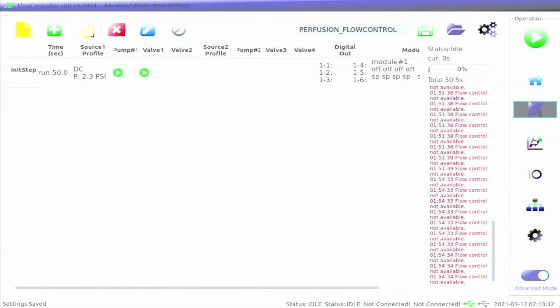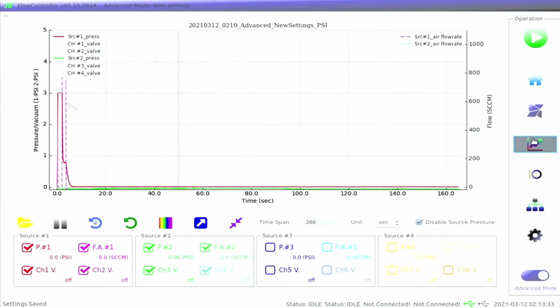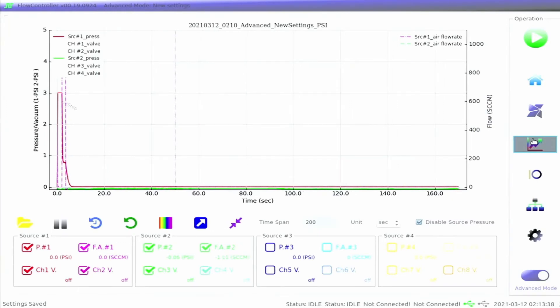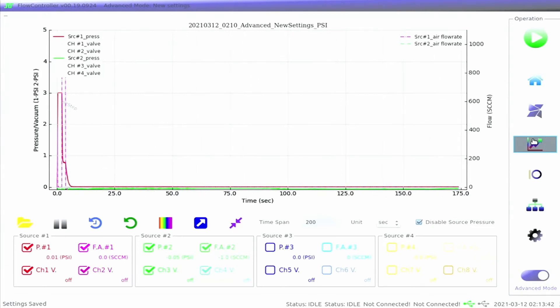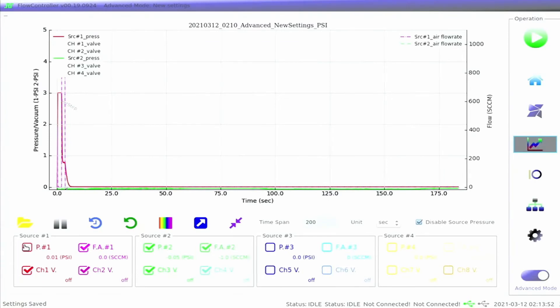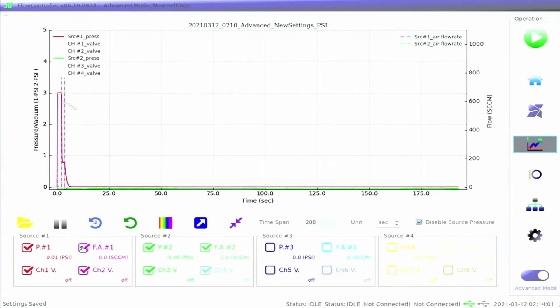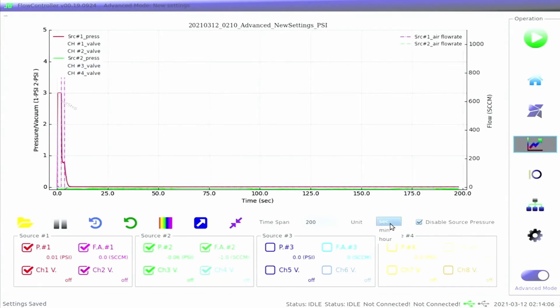Click the real-time curve icon in the function zone to access the monitoring window. Here, users can watch a real-time plot of data, which can be selectively shown or hidden from the source of their choice. The data includes pressure from the source and each valve, as well as the air flow rate or liquid flow rate if a flow sensor is connected.